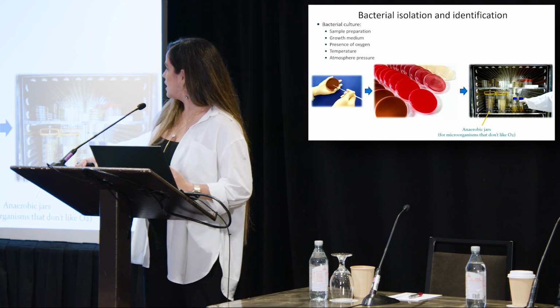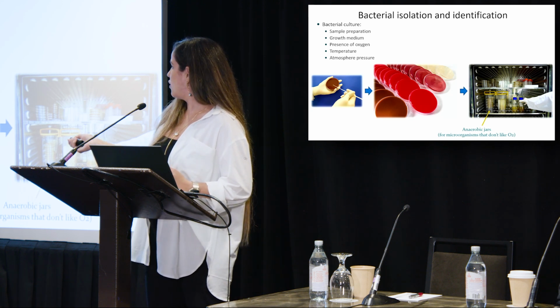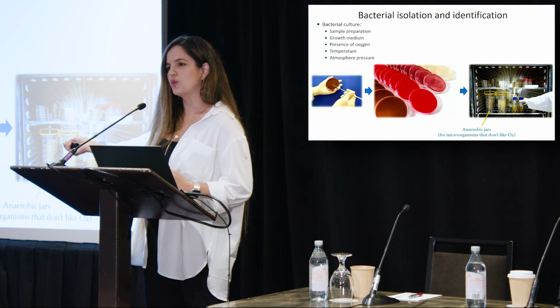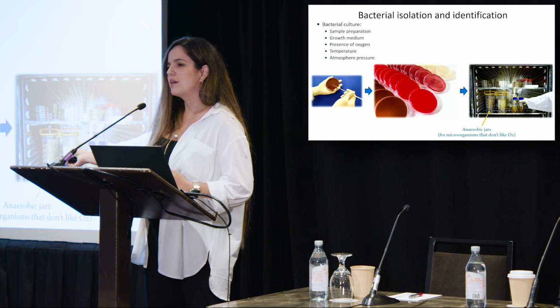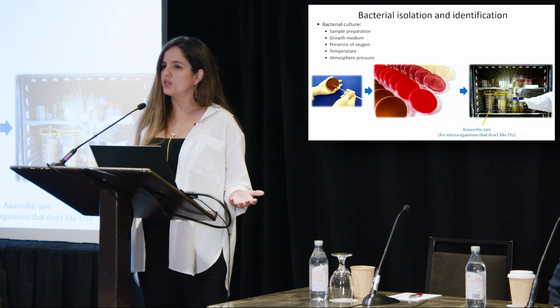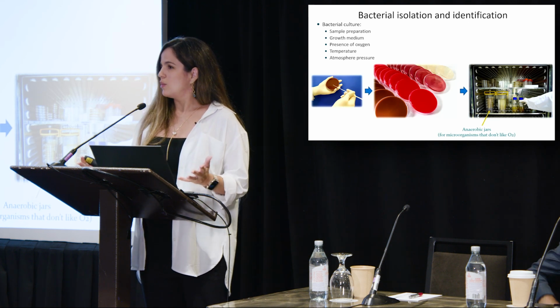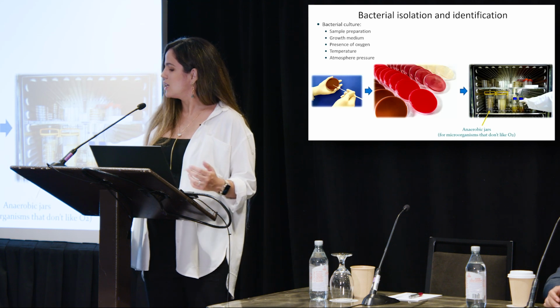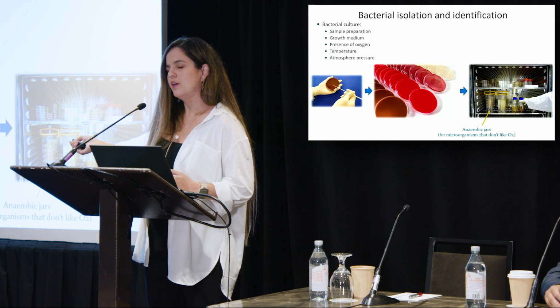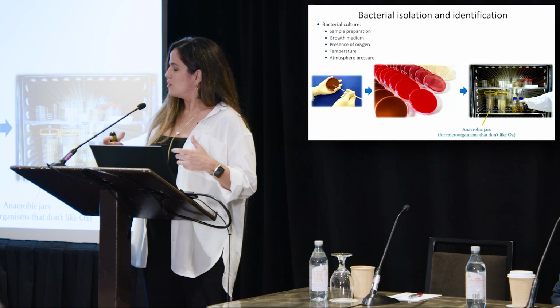So I have a few examples of growth media that we use in the lab, including the MacConkey agar, which we will talk about, that we usually use to diagnose patients with small intestinal bacterial overgrowth. We also use the blood agar, where we can grow more fastidious microorganisms, some of them also disruptors of the microbiome, such as Clostridium difficile, and, although we will not speak about this today, Lactobacillus potentially as well. And we have another agar over here that is mostly for fungi, the Sabouraud agar, on which we can grow Candida albicans, right?